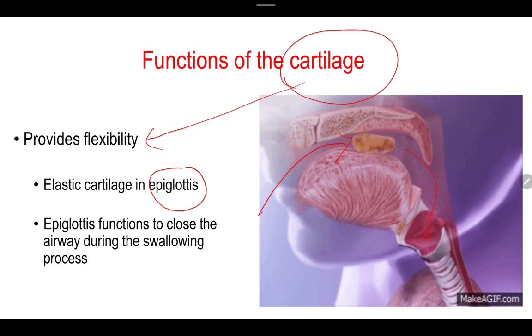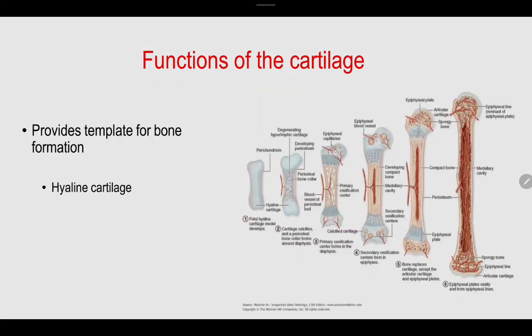Another function of your cartilage is to provide template for the bone formation. When we are embryos, when we are young, inside the womb of our mother, our bodies are made up of hyaline cartilage. Can you appreciate yung presence ng mga chondrocytes dito?